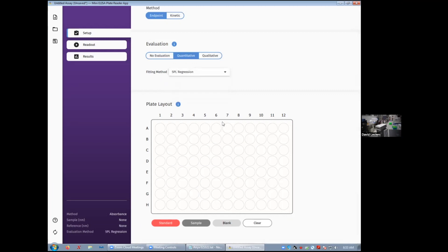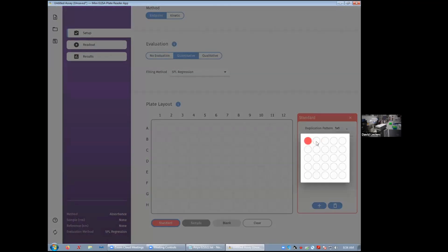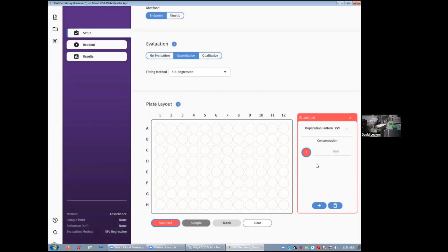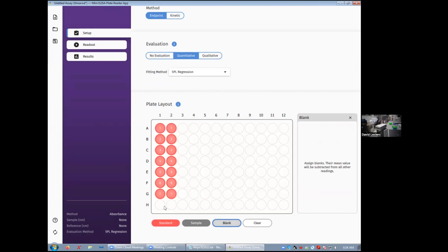And then finally decide on the layout of your plates, and so you decide where the standard samples and the blanks are going to go. Clear is used to correct any mistakes you might have done. Essentially decide on the standards, click on that button, decide on your duplicate pattern. Let's simply put them in place. Same for blanks.